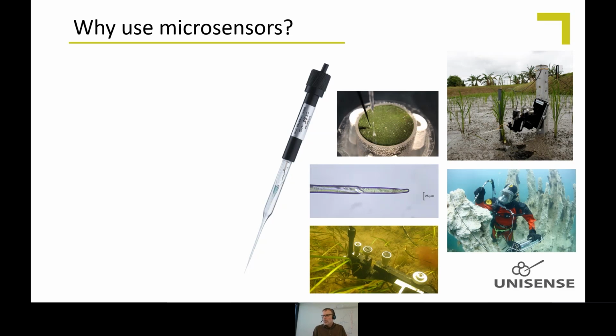So before I go into detail with how the sensors work, I'll just give a couple of examples of what they can be used for and why you should use them. Well, first of all, most people use them because they are small.